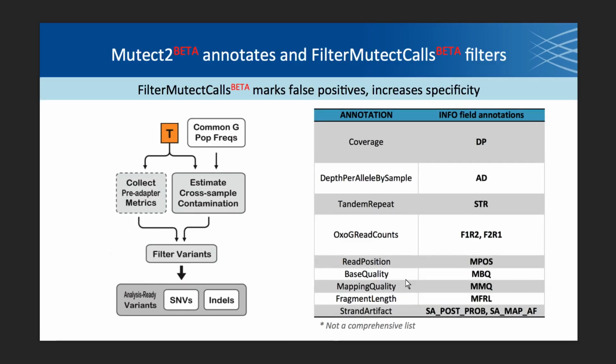We're going to focus on the main filtering done by FilterMutectCalls now. What it does basically is it uses annotations in the info and sample fields in the VCF. It uses all of these to hard filter based on the annotations. I'm not going to go into too many details because this part of the workflow is the most in beta. I know we've just added some new filters recently, and we have removed some. But if you have questions on these, do post on the forum.